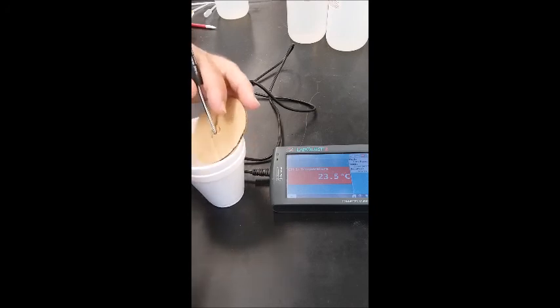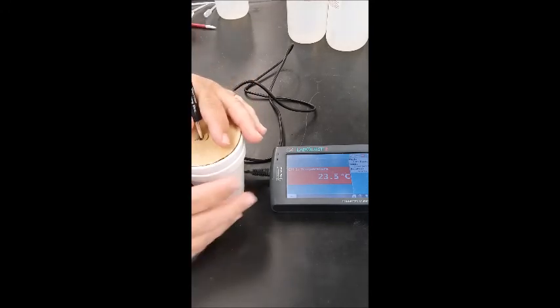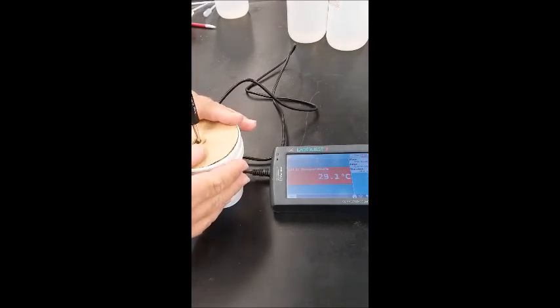After equilibrating, we find the temperature of the sodium hydroxide to be 23.5 degrees Celsius. We're now ready to add the acetic acid to the sodium hydroxide and allow the reaction to occur. As before, the temperature increases quite rapidly as the reaction begins. As we allow the reaction mixture to equilibrate, we find that the final temperature is 29.8 degrees Celsius.